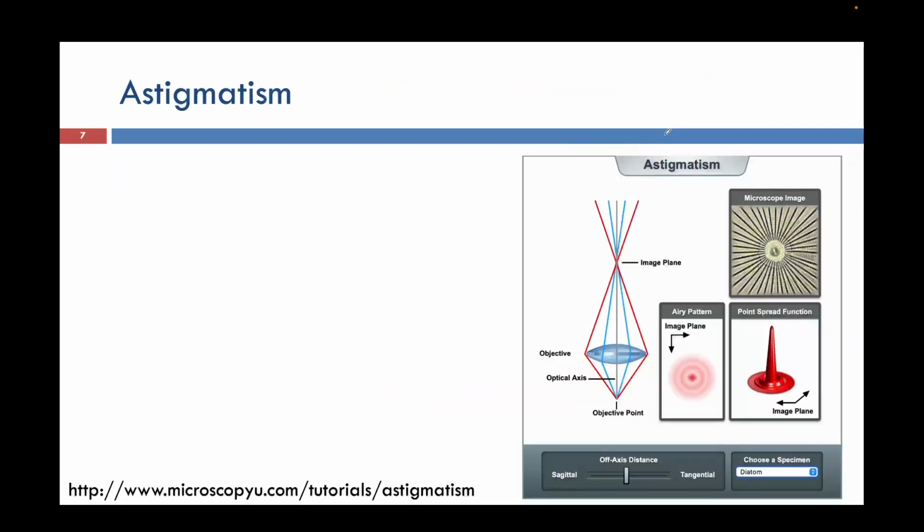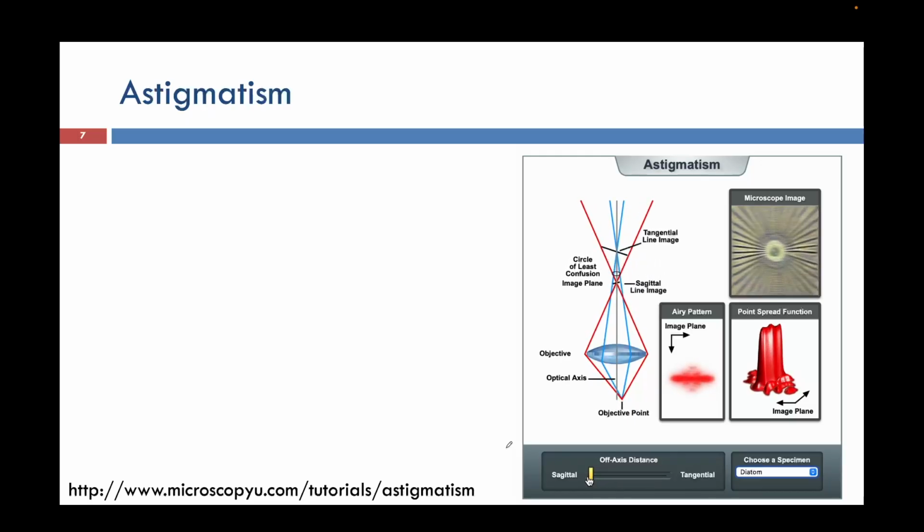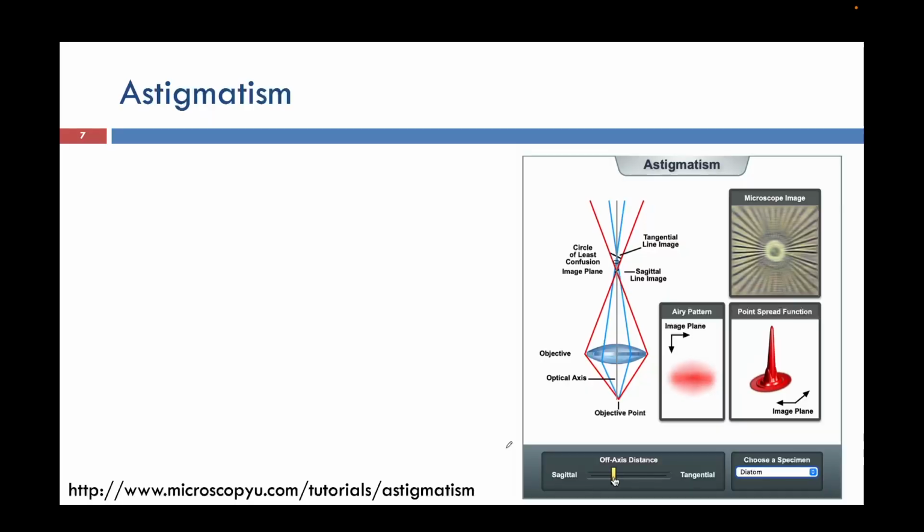So to see, I am just going to show you one video of how astigmatism is affecting this. If you can see, first it was at normal position. So when you take your object towards the tangential plane, and you are leaving it here, you can see when it is going to, okay, now it's in normal mode.